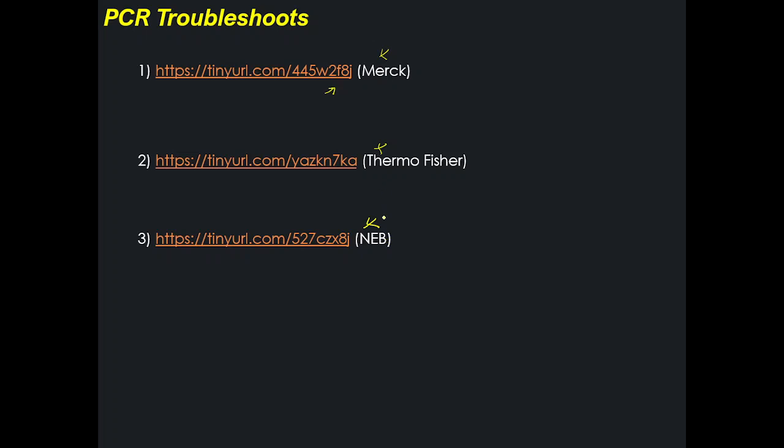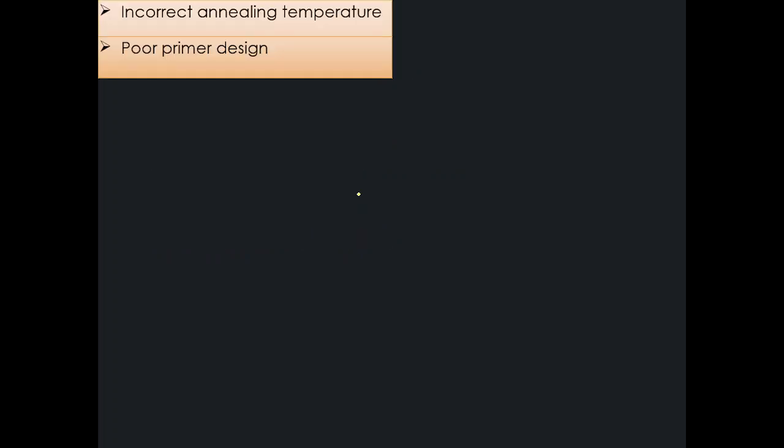You might find, depending upon which vendor you are using, and I'm not here to promote any vendor as such. I'm just telling you there are certain companies, and you can go into the links and find out what kind of exact problems there are. For the sake of time, I'm focusing on only one of the problems, that is no amplification occurred. So let's see what could be the problem, why you are getting no yield, or why you are not getting any amplification.